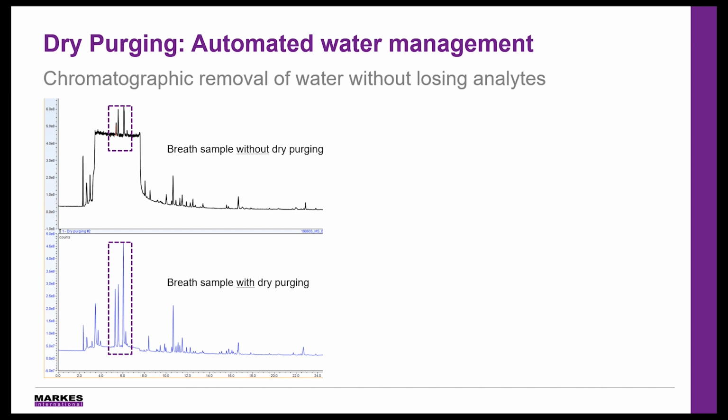If we compare this to the same sample that was then analysed with dry purging, which you can see at the bottom, in this chromatogram you can see optimum purging is being performed. So the same peaks have a much higher response now the elevated baseline from water has been removed. This has increased the signal to noise value and therefore has improved the overall sensitivity with one easy method change, whereas in the first image the results would be underreported.